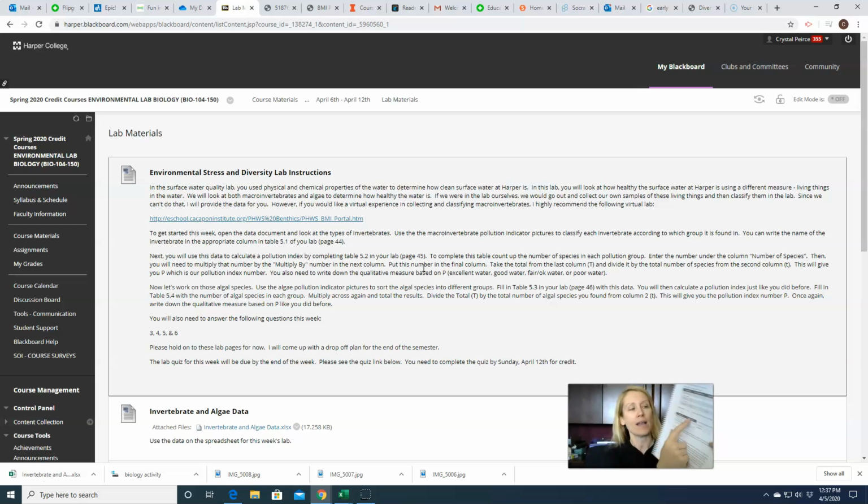So then you'll find out which category you fall in. Okay, you're going to write the number down, and then you're also going to write down the qualitative, which is this part, which is excellent, good, fair, okay, or poor. All right, so that's part 1. You're going to do that with the macros. Part 2, you're going to turn the page and do the exact same thing we just did, but you're going to do it with the algae species instead.